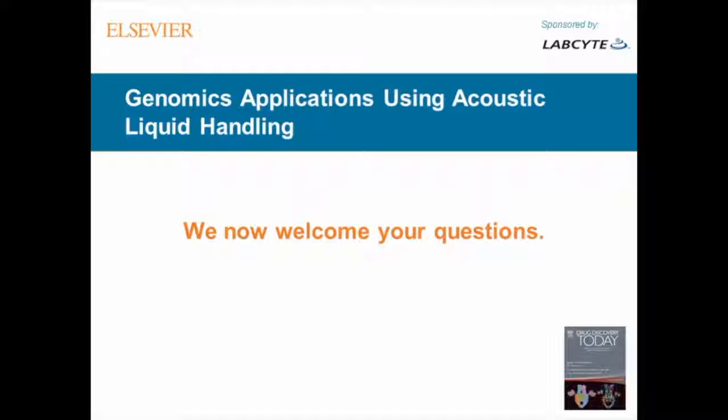So the Echo would be very useful there in terms of adding a very small amount of these enzymes to do an additional cleanup post-elution. We haven't proven that out yet, and in-house we don't have the ExAmp chemistry reader. So we'd be looking for a partner to prove that out if people are interested.